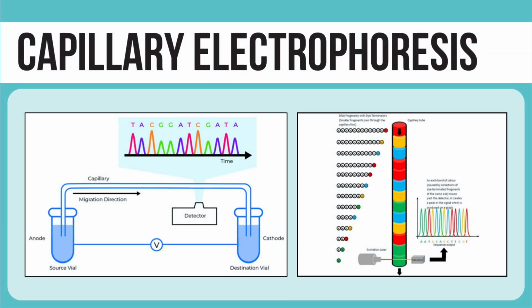So, what do we do now with these differentially cut DNA fragments? Here comes another molecular technique, capillary electrophoresis. After performing a chain termination PCR, we use capillary electrophoresis to analyze and interpret the differentially cut DNA fragments and read the exact sequence of nucleotides in the target DNA.